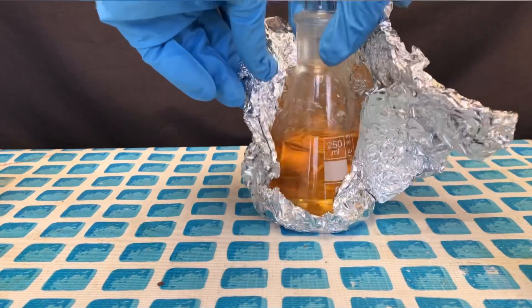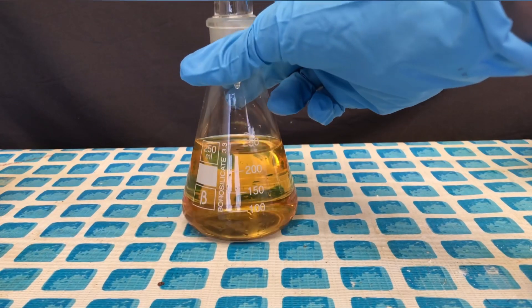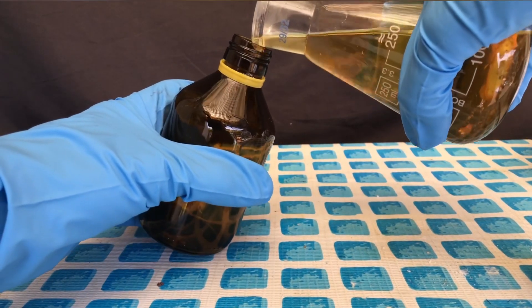In the end, about 227 grams of this yellow liquid right here were collected. Adding some sort of polymerization inhibitor would be wise, but I don't have one and therefore I will have to stir it like this without any inhibitor.